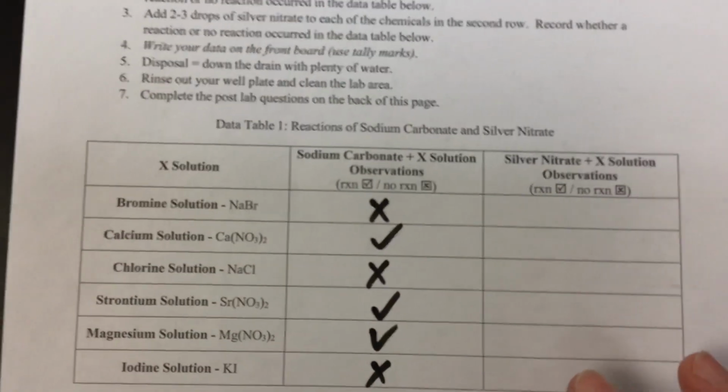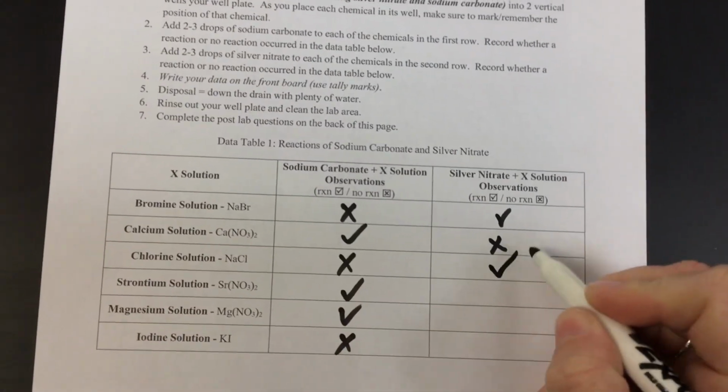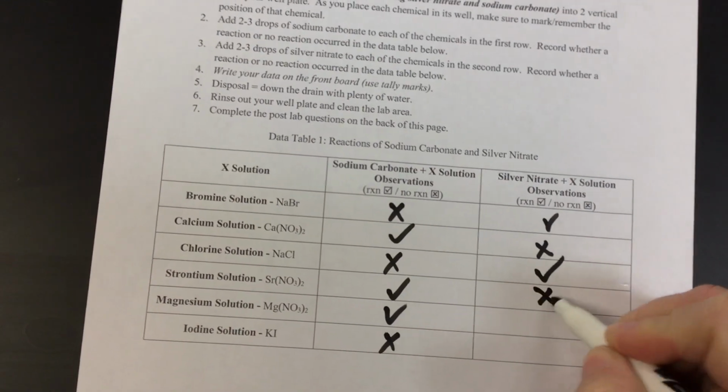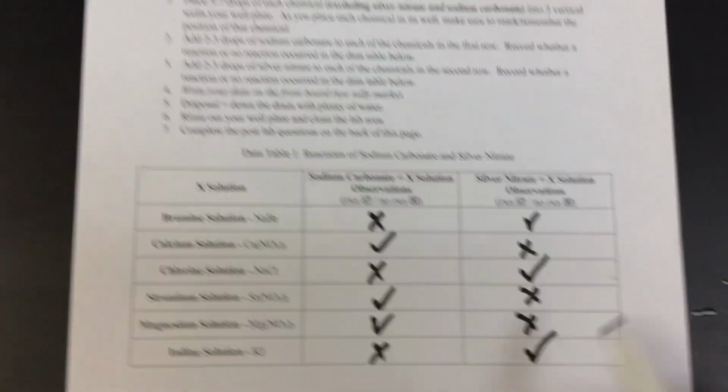And then the silver nitrate and how it reacted with these things. In the first, it did. In the second, it did not. Whoops, sorry. In the third, it did react. In the fourth and fifth, it did not. And then the sixth did react.